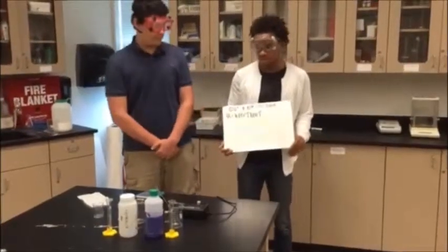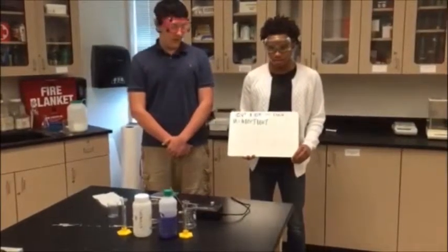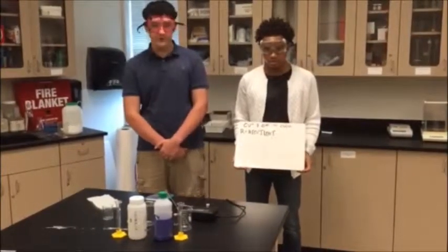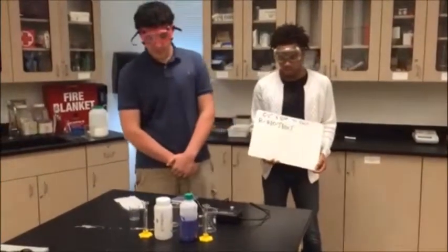Alright, so my name is Aaron, I'm Walt, and we're doing the decolorization of crystal violet labs. This is for learning objective 4.2, where we have to determine the order of a reaction based on concentration versus time data, or absorbance versus time data, because of Beer's law.